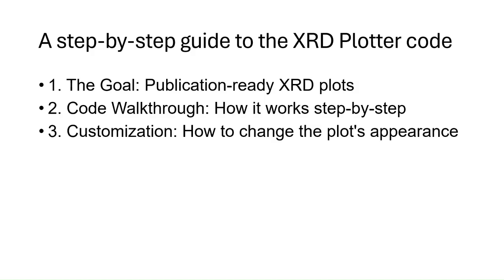First, we will walk through the code step by step so you know how it works. Then I will show you how easily you can change settings like the color, line thickness, or style of the peak labels to get exactly the look of the plot that you want.